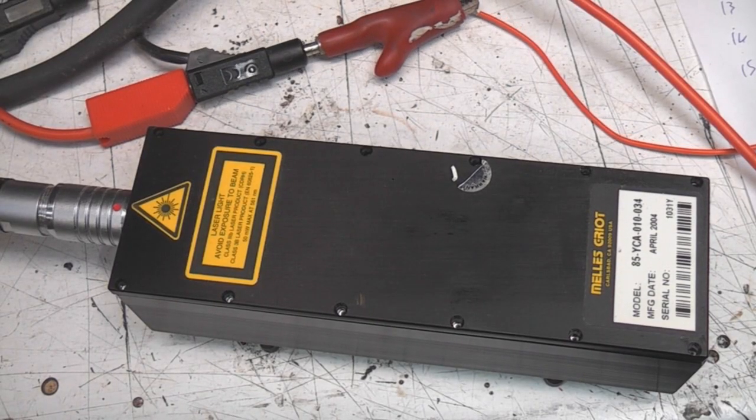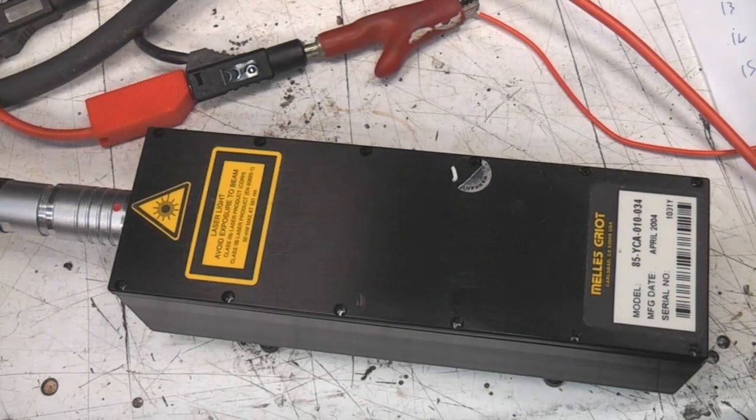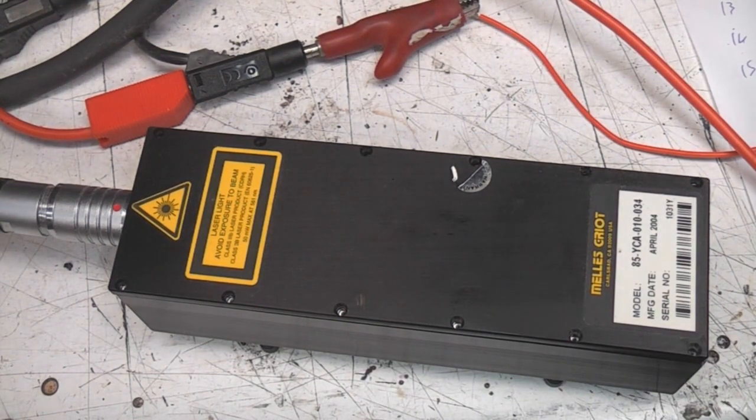Right, so now to look at this solid state laser. So this is 561 nanometers, which is sort of yellowy green. I think it's fairly close to the colours of the earlier green LEDs before we got the true green ones. So not really yellow, more a pale lime green.